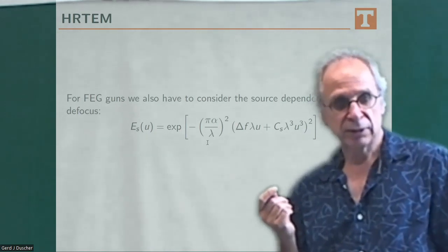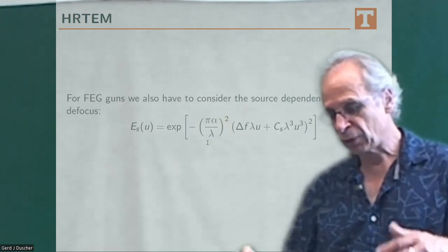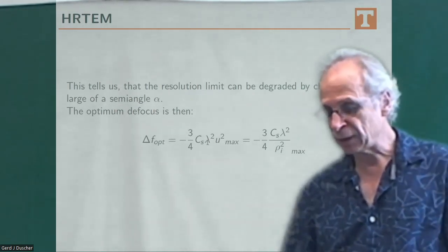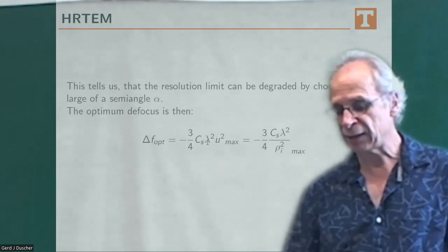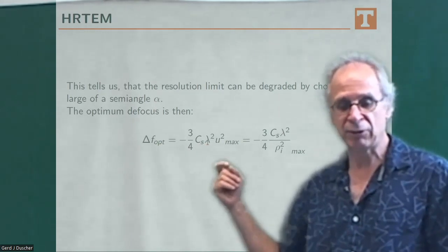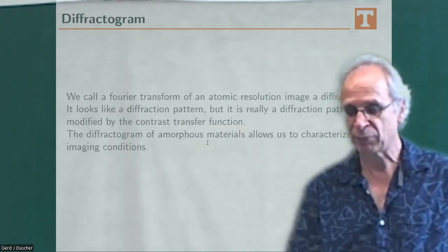Say, coherence of the source is important. And then we have an angle characteristic here. So the larger the angle, the stronger will be the dampening that you take with you. And that is also focus dependent. And so we have different influences on that, two different major aberrations that we can in one case vary and in the other case is our microscope. With aberration correction, this all moves down the line to the last significant aberration, and you get similar things.